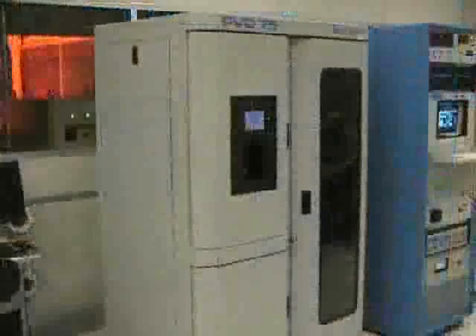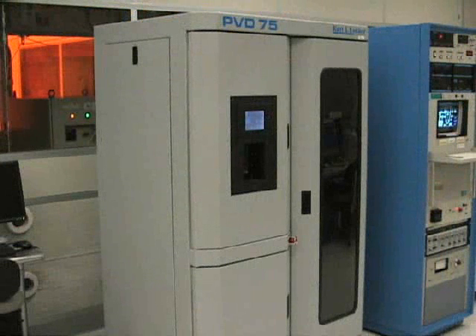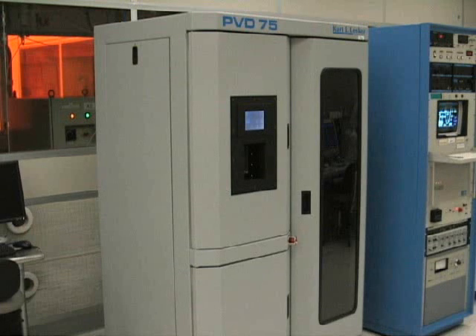In most cases, metal depositions are performed in the CBC electron beam evaporator or in the CBC DC sputter. The PVD-75 is a good choice for samples that need to be evaporator coated so that the sides of rough topologies are not coated, or for samples that are sensitive to X-ray radiation that may be emitted by the electron beam gun in the E-beam evaporator.